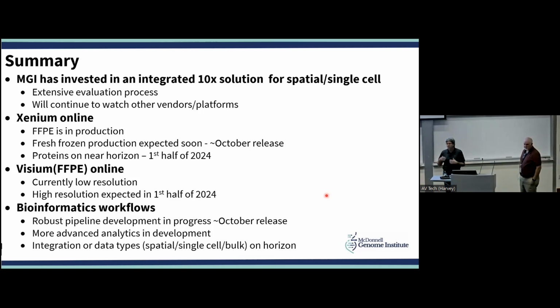That includes all the prep work, and I think that even includes the DDRCC component. That's basically 2 slides worth, and then however many sections you can get into those 2 slide areas. That's internal. If there's anybody from outside, depending whether you're profit or not-for-profit, it can go up another 20-25%. But internally, on the order of about $7,500 for a 2 slide run.